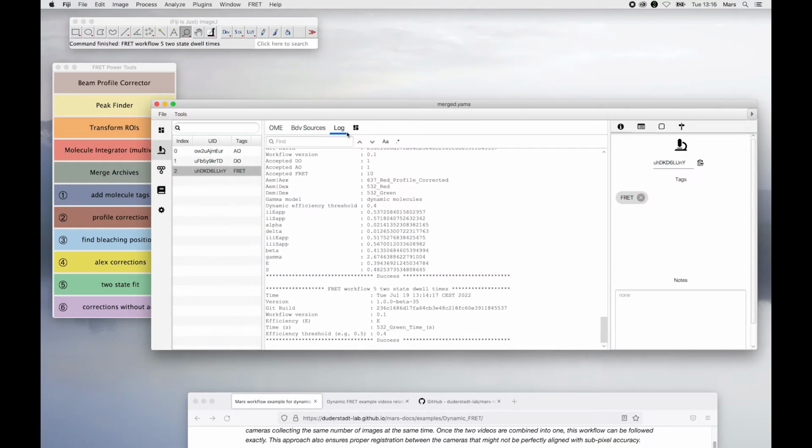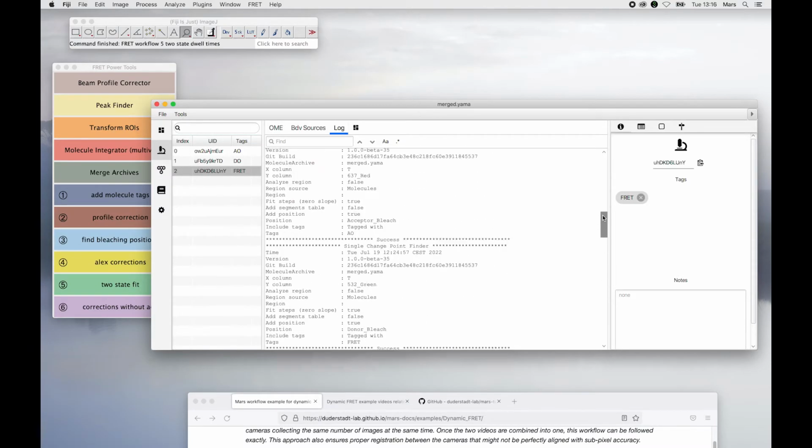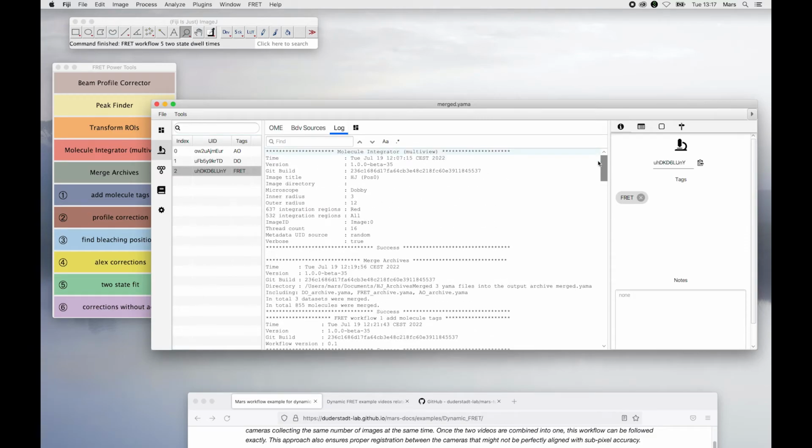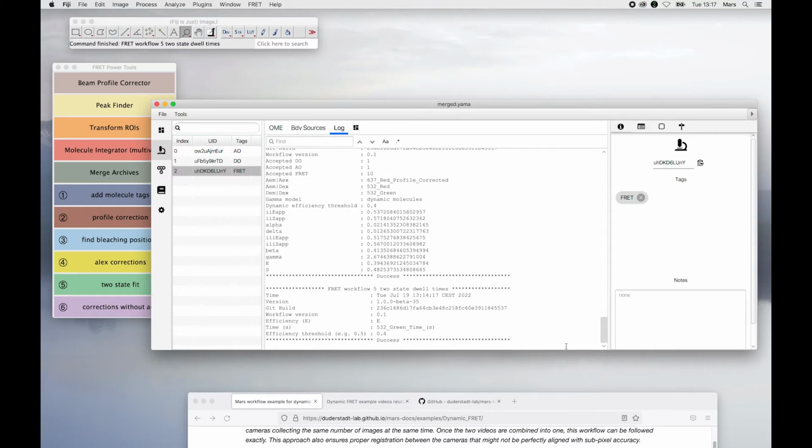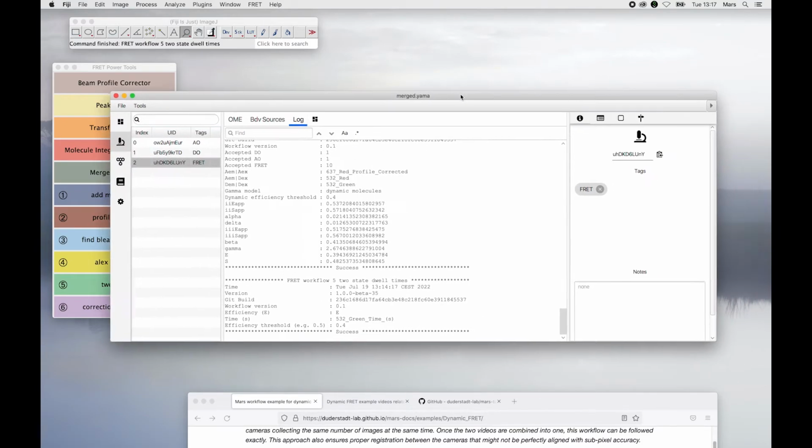One thing you can also do is check in the log, and in the log, if you go to the metadata tab, you have 3 different metadata records, and each one of them has a unique log. And this is so if you do some processing steps and then you merge, you have an intact log for each metadata record. You can basically look through and see all the tools and the settings that were used for this pipeline. Those are all saved in here.